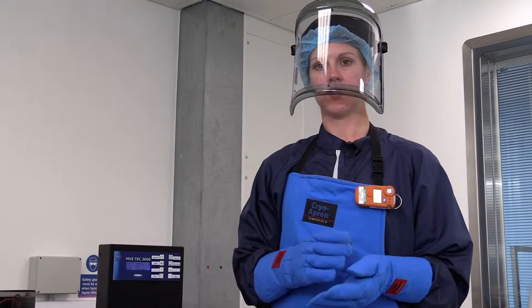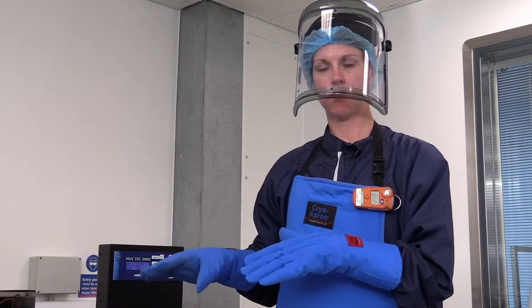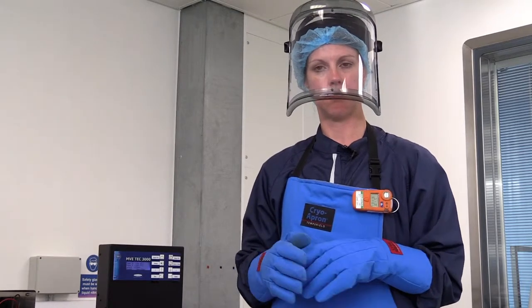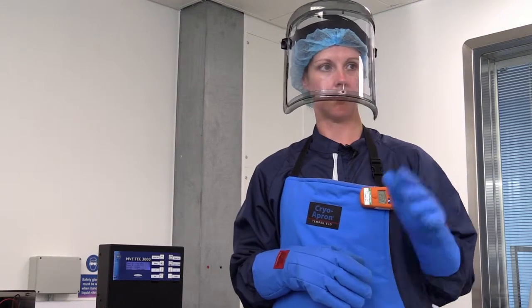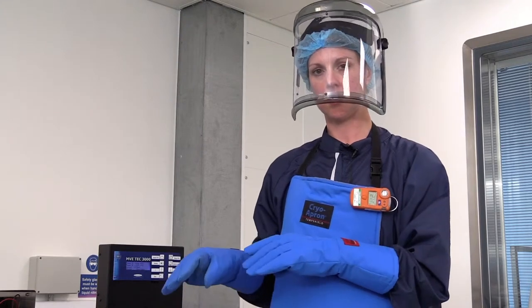One of our important parts of the job is to transport these samples around the world. We prefer to send these samples rather than transporting live mice from a welfare point of view — that's much kinder to the mice. There can be scientists all over the world in America, Japan, or Australia who are interested in the mice with these mutations.